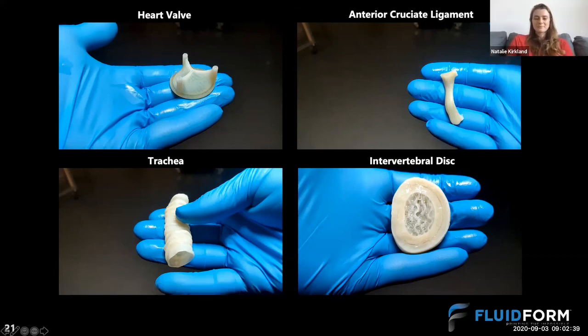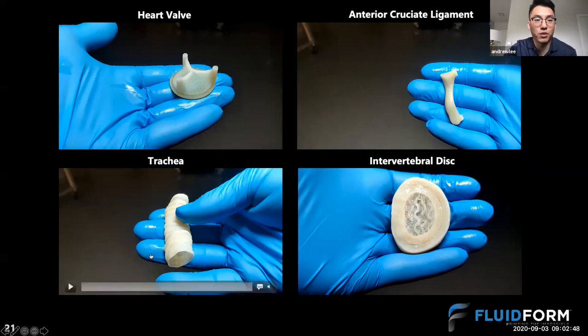The answer would be yes. If it's uncross-linked, it will just diffuse out of your print. When you release the whole thing, you can wash it away, and again, it really is up to you to design the experiment. A lot of this is very similar to how you would approach tissue engineering, fabricating different 3D gels for cells. We've added the component of a 3D printer to now arrange all of this in 3 dimensions.